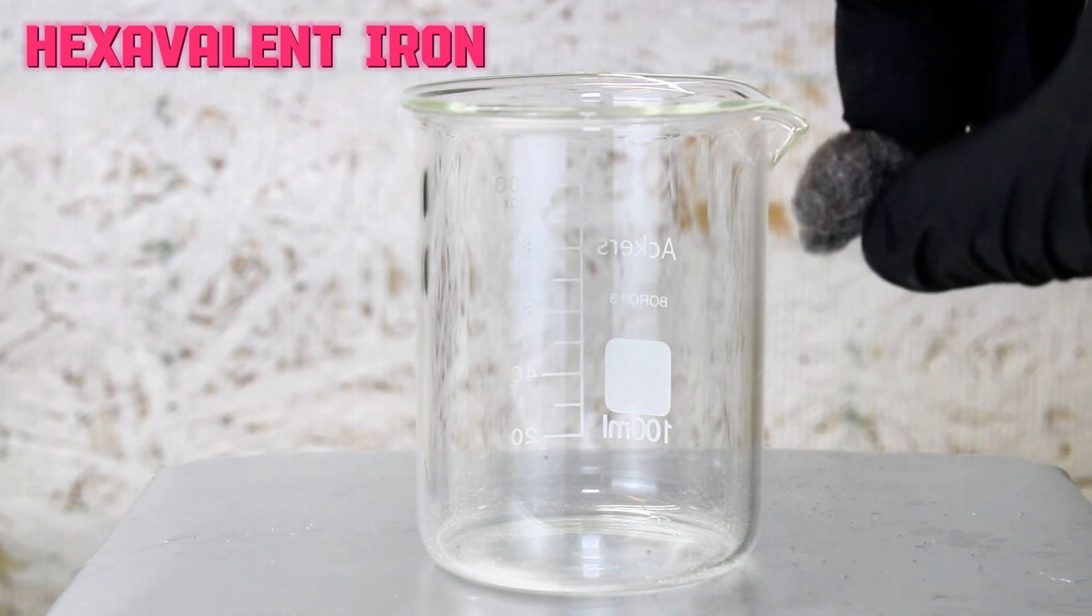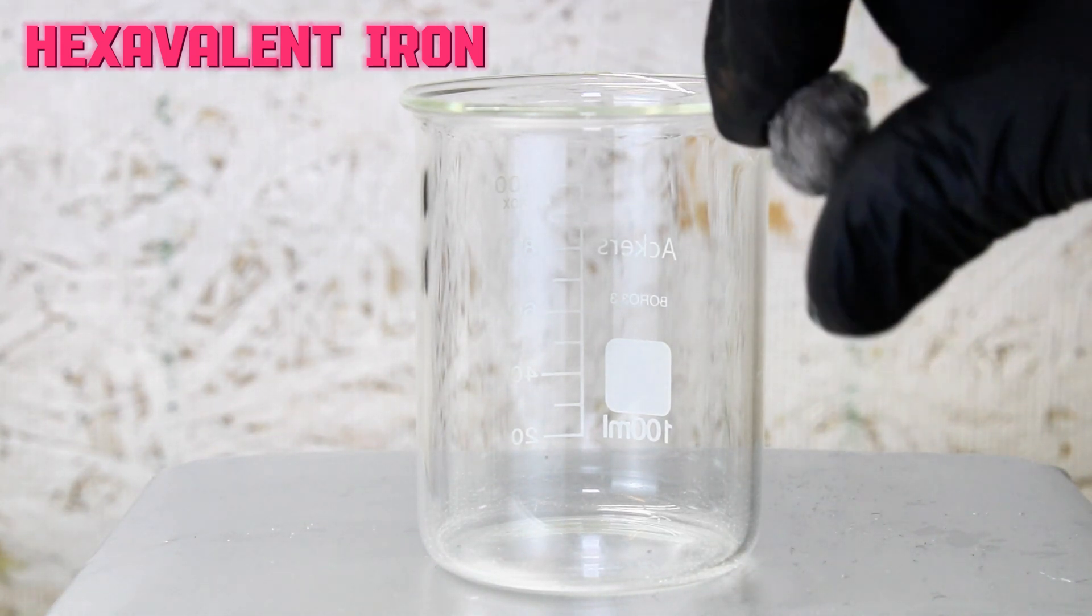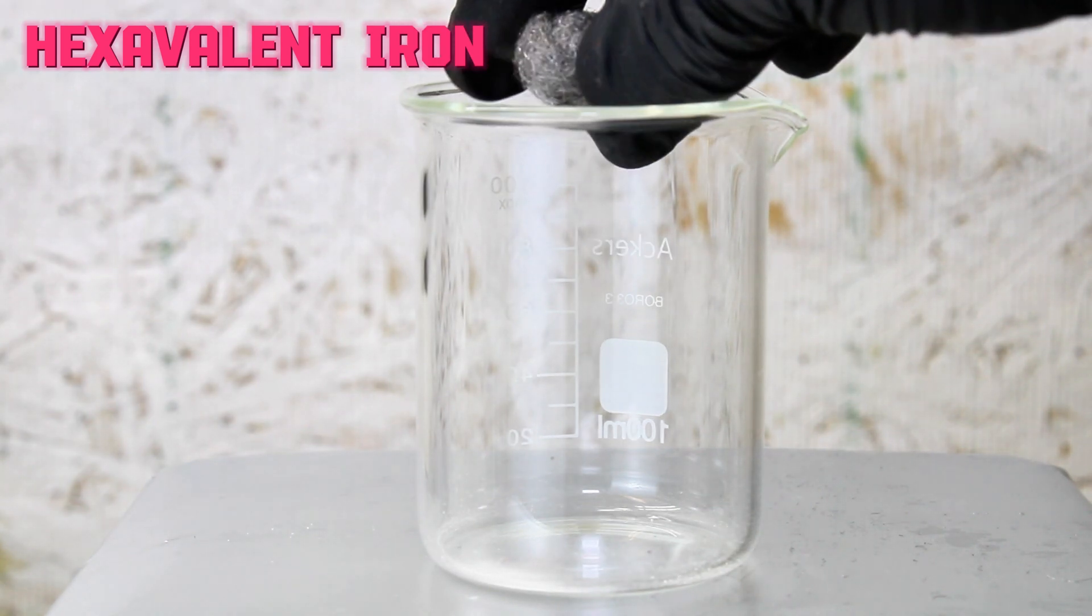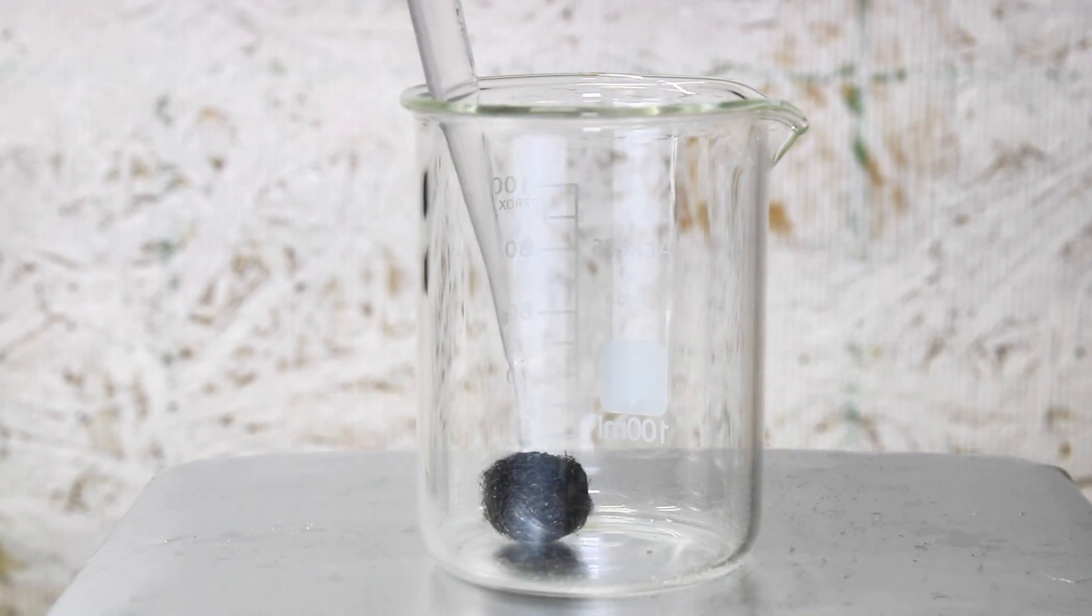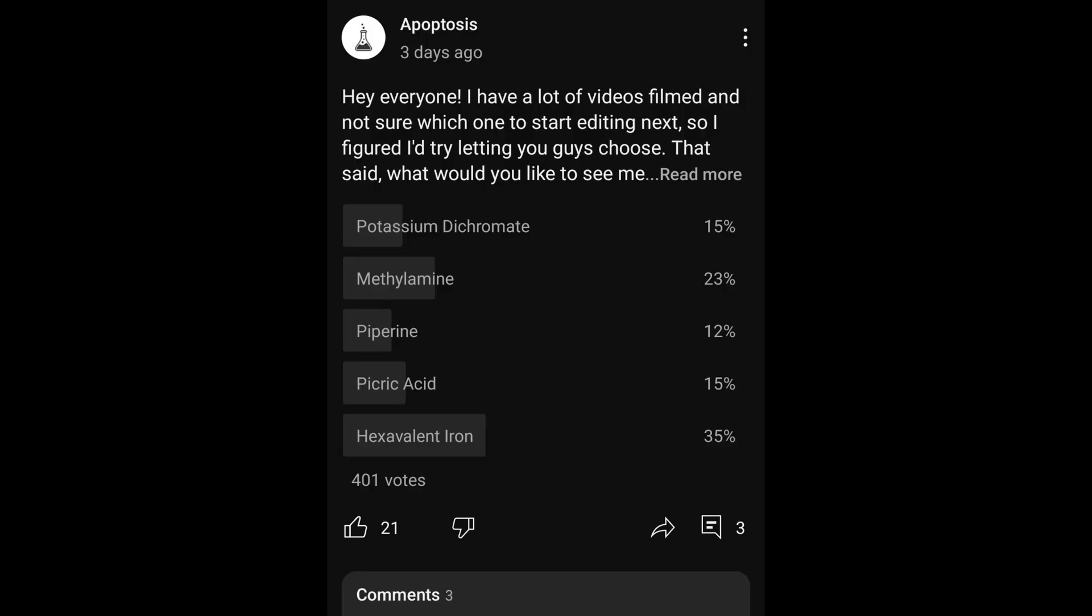So I've got a lot of projects filmed right now and I haven't been sure what order to release them in, so I decided to hold a YouTube poll and let you guys decide. Once I got all the votes in, the clear winner was hexavalent iron, or iron in the 6+ oxidation state.